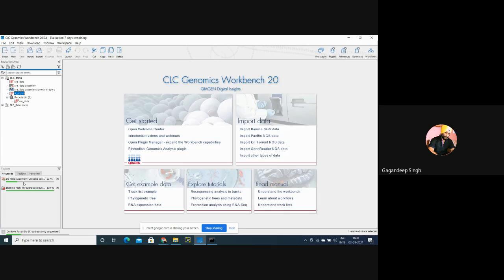Okay, we have to wait for some time. That's why I have selected very little data, so that assembly will be covered in less time. But whenever you select data for analysis by means of next generation sequencing, you have to select data in GBs or in TBs.